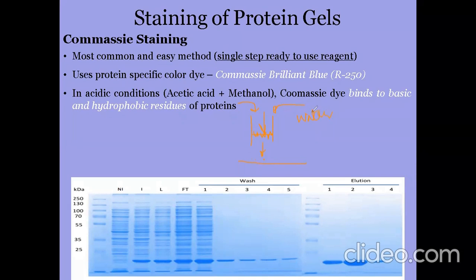Okay, we will add water, and the DNA has affinity for water, and it will elute from the column, and we will get only the pure DNA.